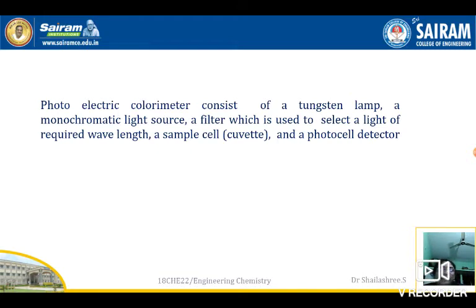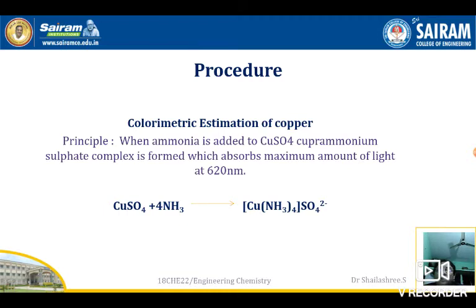Coming to the experimental part. See here, the principle here is, I told you this experiment is applicable to colored solutions. If they are not colored, nothing to worry. We can add suitable reagents to make them colored. For example, copper sulfate is light blue in color.